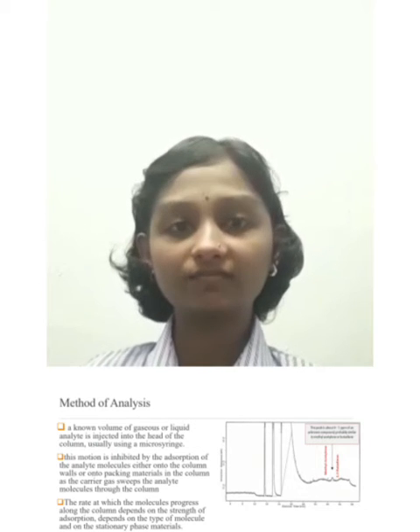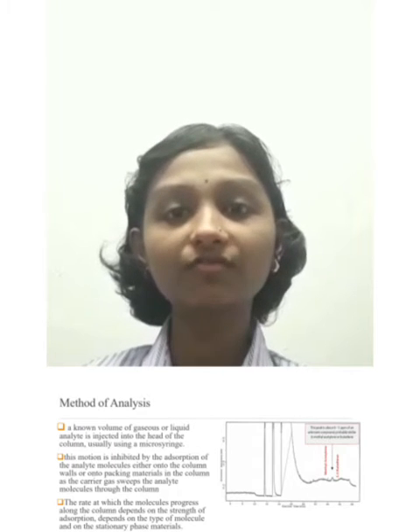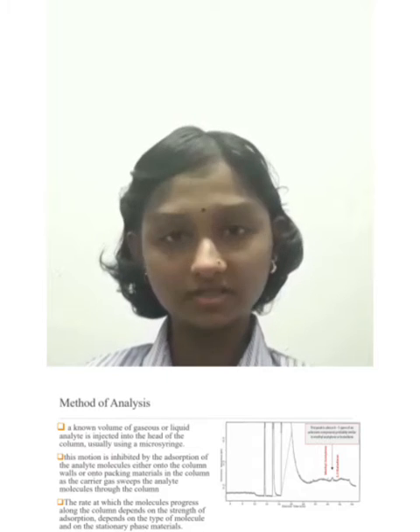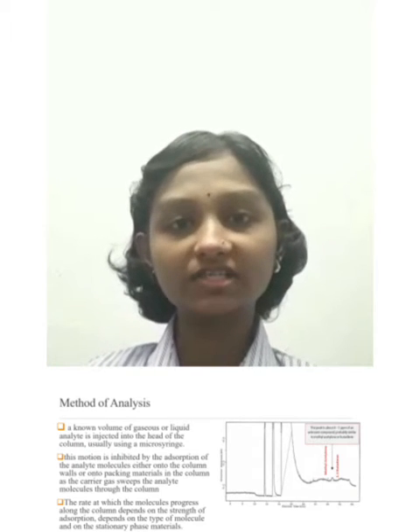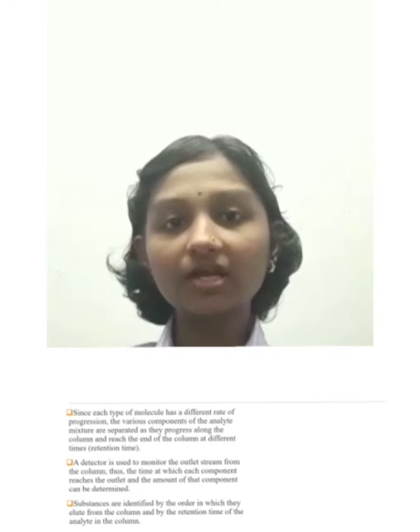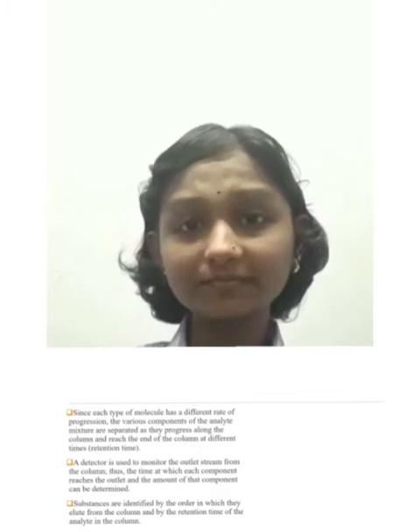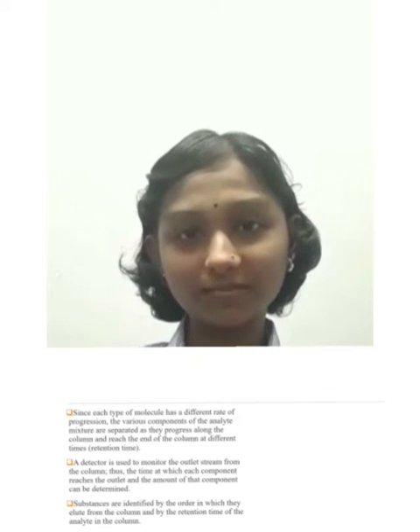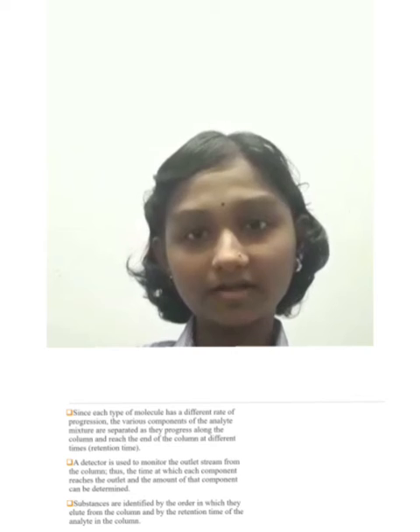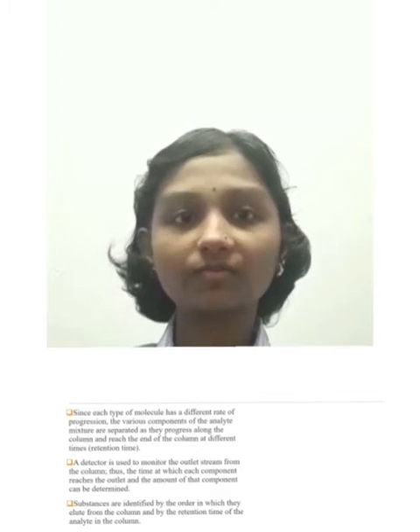The rate at which the molecules progress along the column depends on the strength of adsorption, which depends on the type of molecule and on the stationary phase materials. Since each type of molecule has a different rate of progression, the various components of the analyte mixture are separated as they progress along the column and reach the end of the column at different times, which is the retention time. A detector is used to monitor the outlet stream from the column.